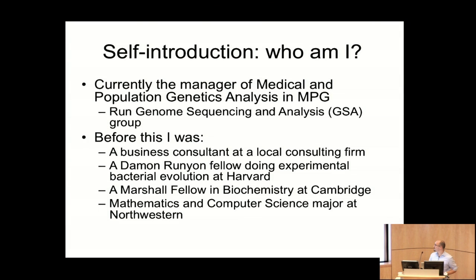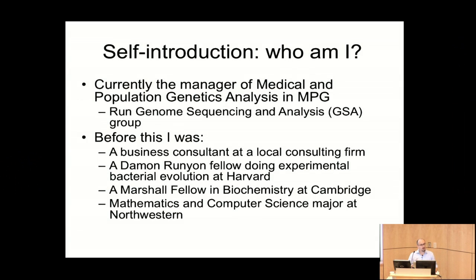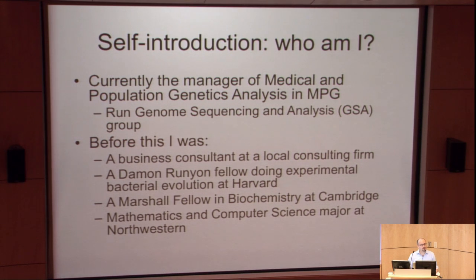So this is my self-introduction. I'm currently the manager of medical and population genetics analysis in the medical and population genetics program. As part of that, I run a group called Genome Sequencing and Analysis. We do a lot of projects here at the Broad. This is the 1,000 Genomes Project. We do a lot of the medical genetics projects. We develop a toolkit called the GATK.